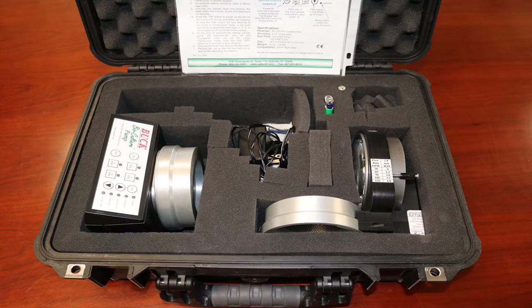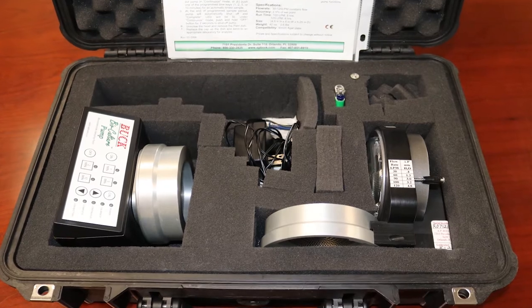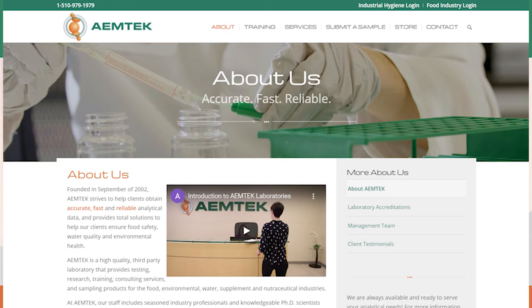Here is the Buck Bioculture pump. It is a bioaerosol sampling pump designed to draw air onto a standard agar plate. The sampling pump is available for rental at the EmTech online store.